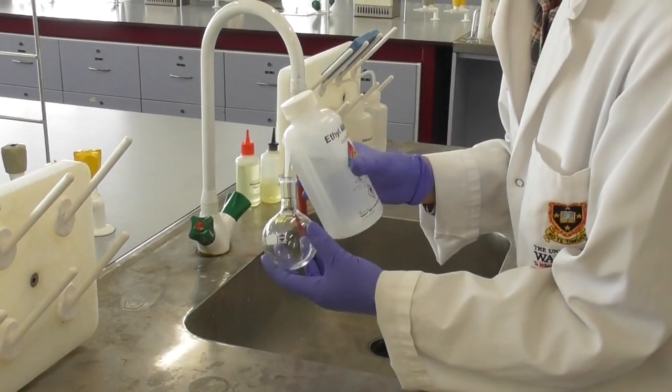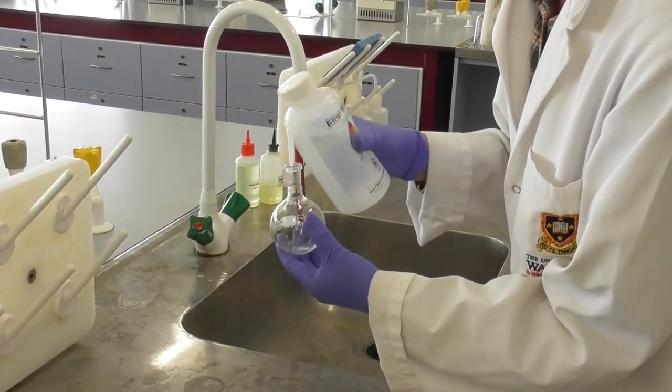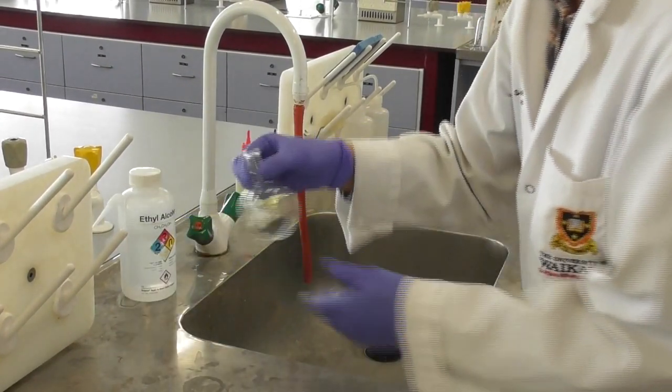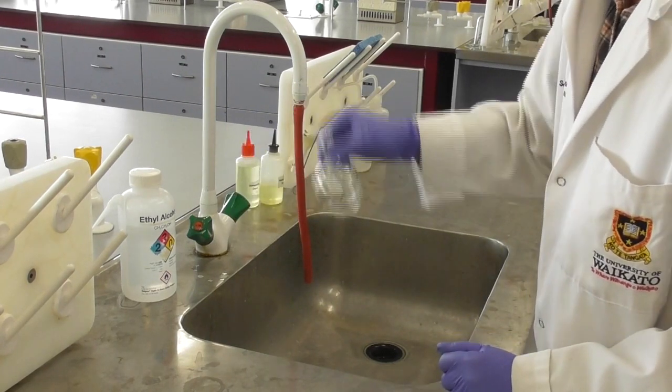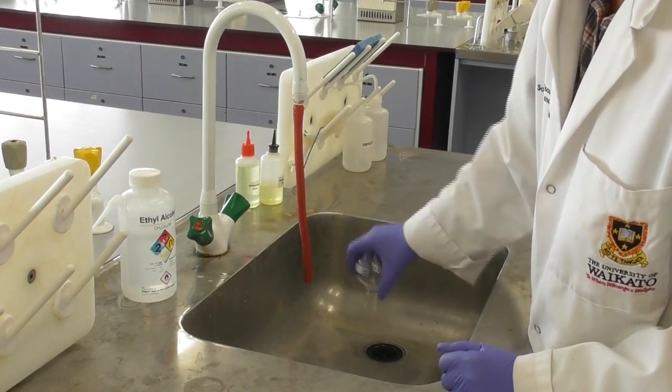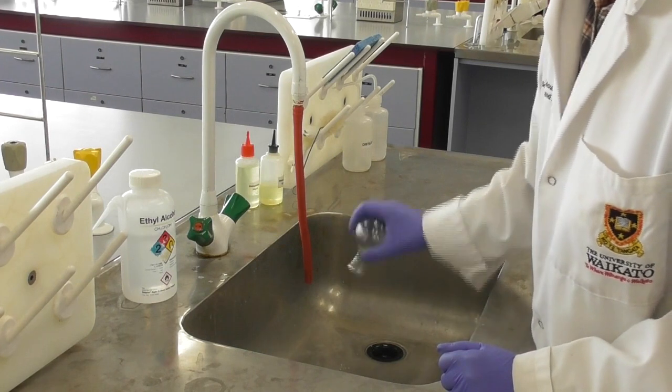We carefully rinse the round bottom flask with ethanol or acetone and then let it dry on the drying rack.